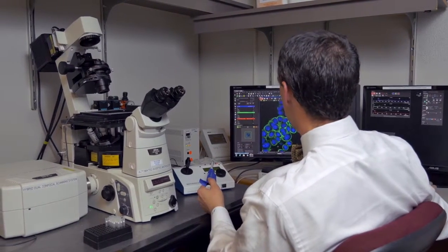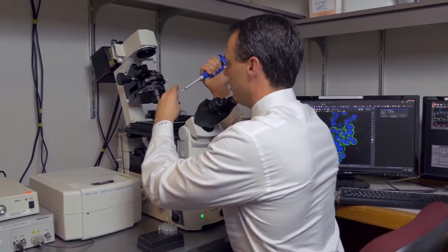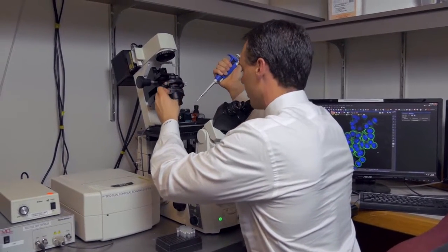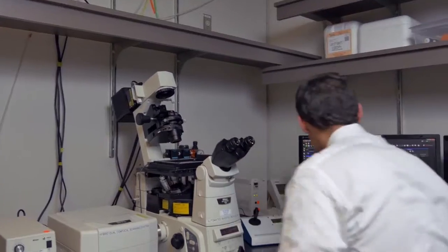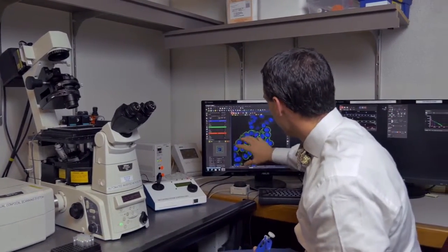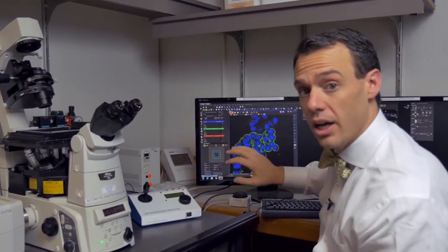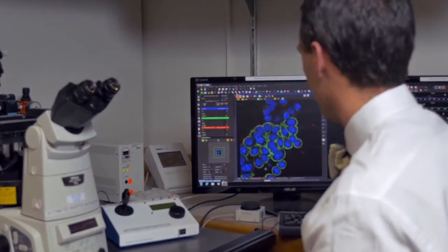So what I'll do is I'll go to all three channels, and I'll be adding these essential oils in real time. I just got a 100 microliter pipette here. I'm going to be adding a few microliters of this particular essential oil. Okay, so as you can see, we are now starting to see red coming as I added the essential oil to this culture. These are living human cells. We are starting to see some interactions going on here.